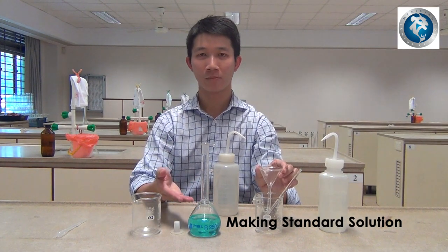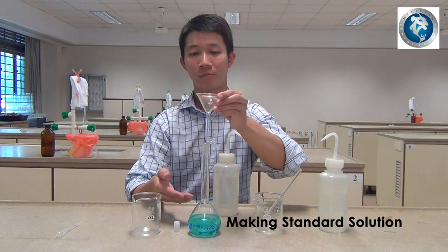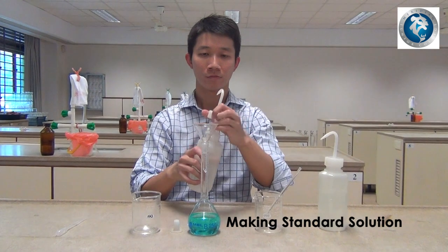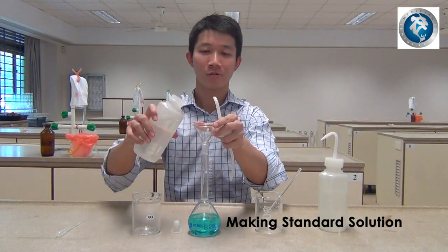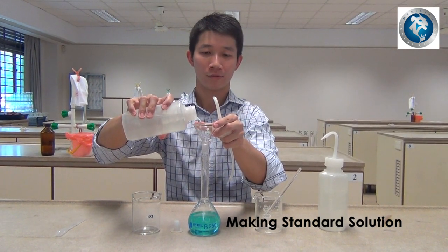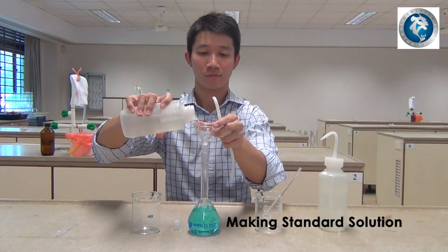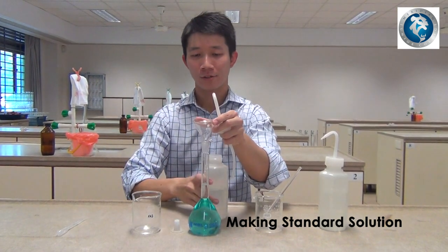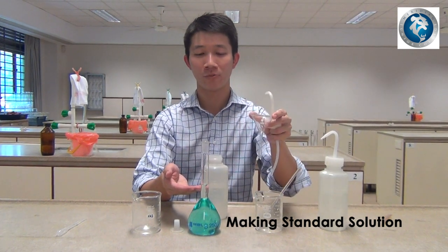Next, we will have to top up the standard solution. Place the glass funnel back onto the volumetric flask. Using one hand to hold the glass funnel, slowly pour the de-ionized water until the solution has reached the middle of the neck of the volumetric flask.